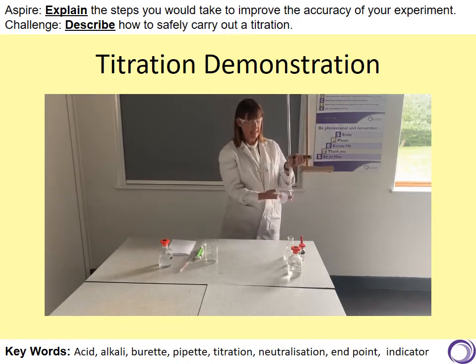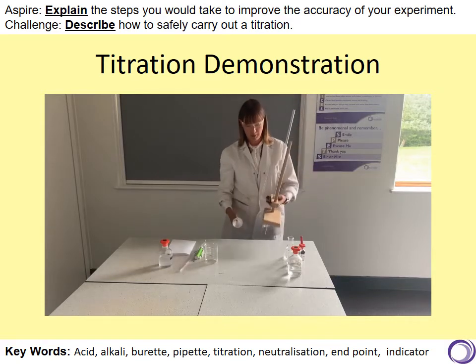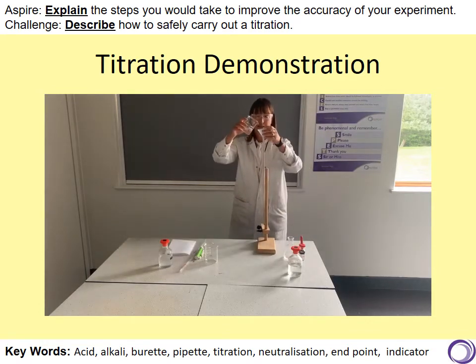Before I start putting the acid in, I need to make sure that my tap is closed and that it's crossways, otherwise the acid will just come out. I'm going to put my funnel in the top and I'm going to add some sulfuric acid.